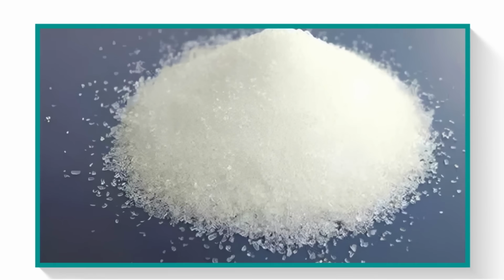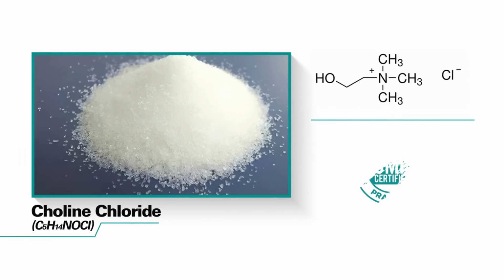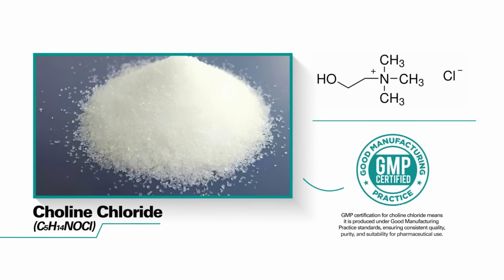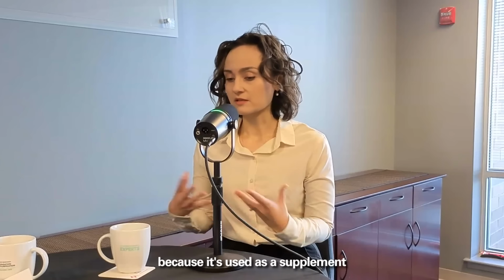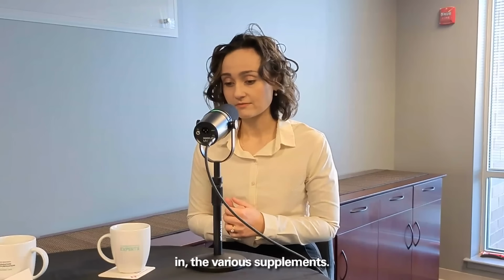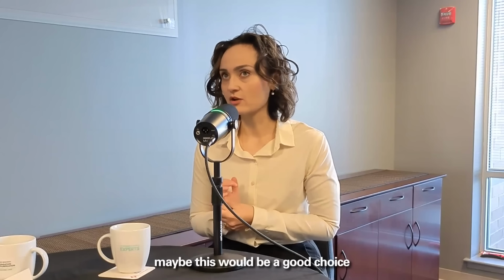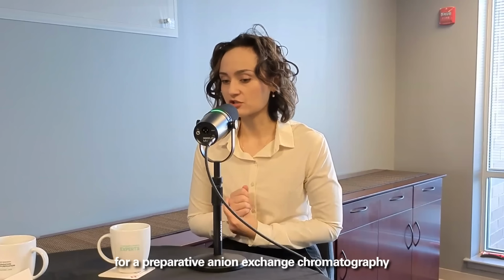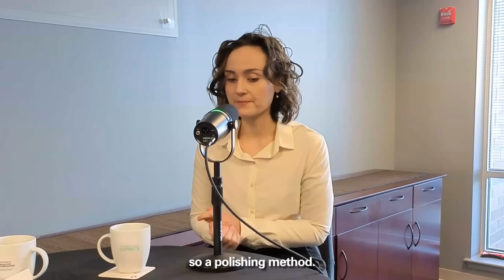Choline chloride is a non-toxic salt because of its favorable safety profile, and also the fact that it's available in GMP grade already because it's used in various supplements. Because of that, we thought this would be a good choice for preparative anion exchange chromatography for AAVs to separate empty from full, so a polishing method.